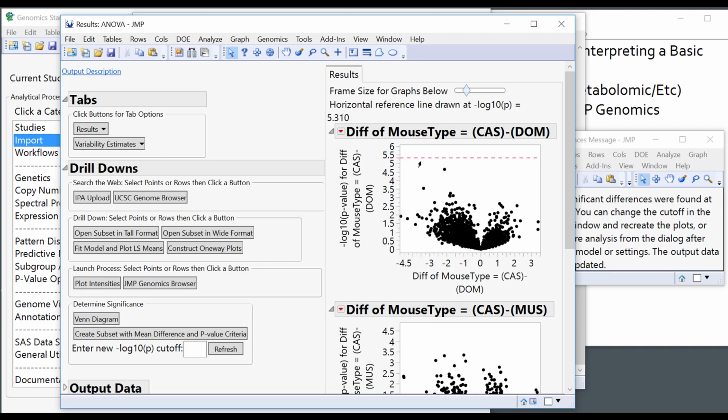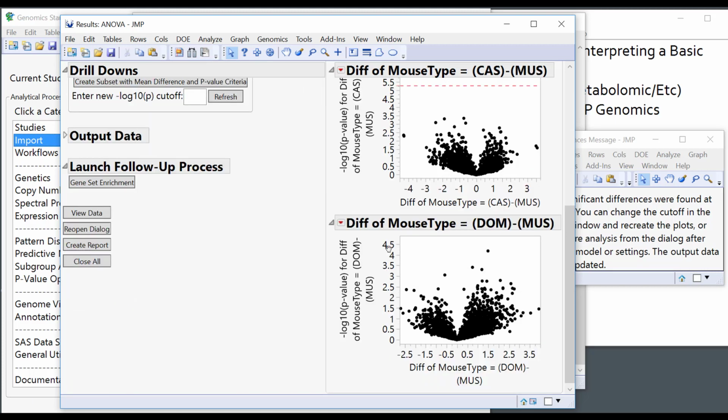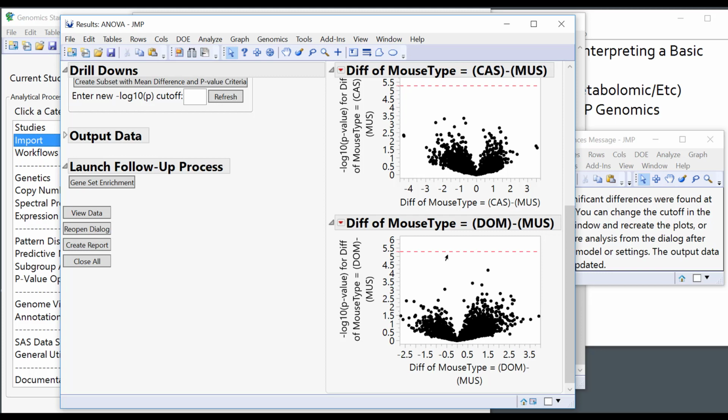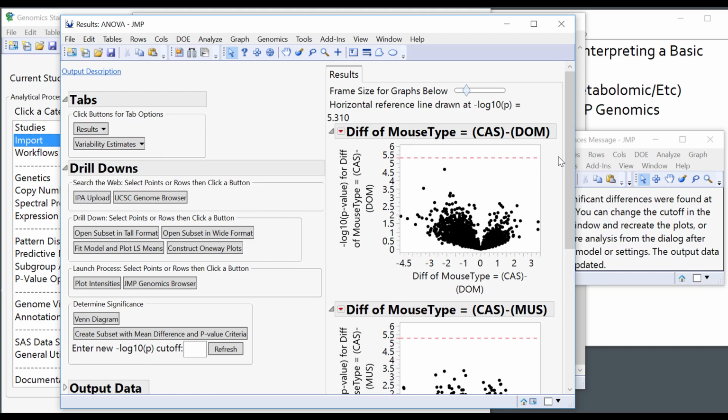So here you can see there's a dotted line at that cutoff. I can make the same dotted line down here and down here. Those will show up automatically as long as you've got data above them, but we didn't. So this is the problem. We set a cutoff. We said this is the place, if you get something more significant than this, that's a marker we care about. And the answer, unfortunately, in this data is there was nothing significant to find. We couldn't find anything at our threshold.